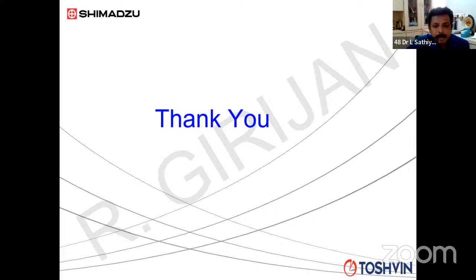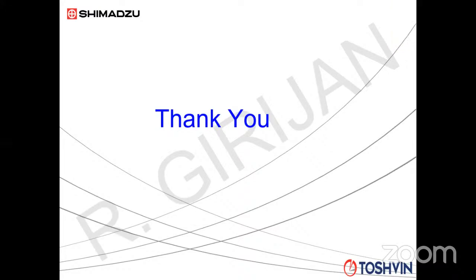With the Shimadzu system, are the GCMS libraries available for the standards? Yes, sir. Libraries are available. We have both standard libraries like NIST and Wiley, and additional libraries like drugs, pesticide, polymer and toxicology libraries. But when you buy a GCMS system, by default you will get the latest NIST library, which contains more than 3.5 lakh mass spectra.